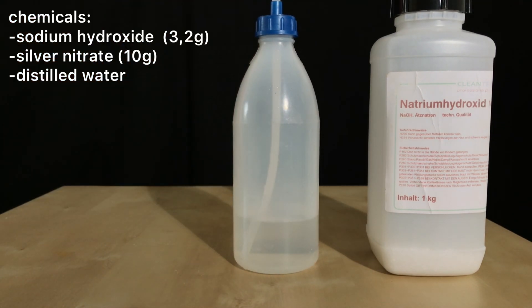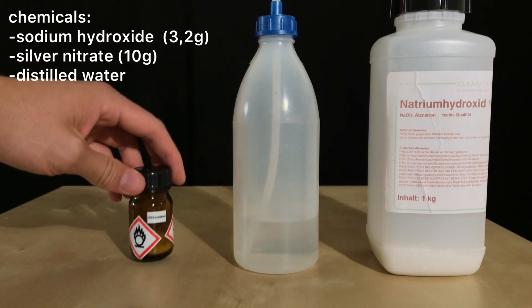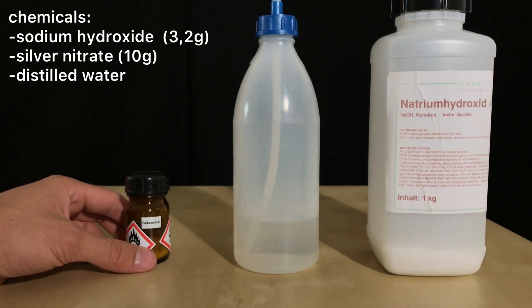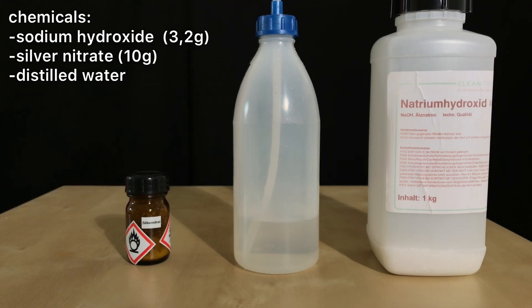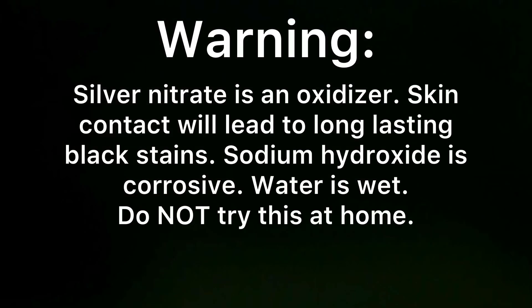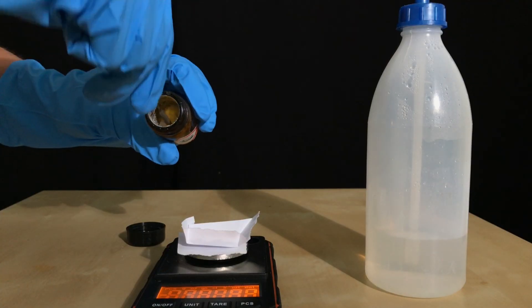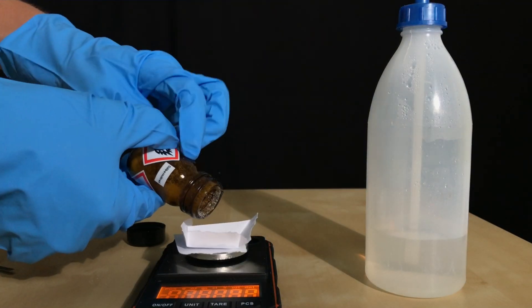In order to make silver(I) oxide, only three things are needed: sodium hydroxide, distilled water, and silver nitrate. As always, here's the disclaimer: don't try this at home, and let's dive right into this experiment.